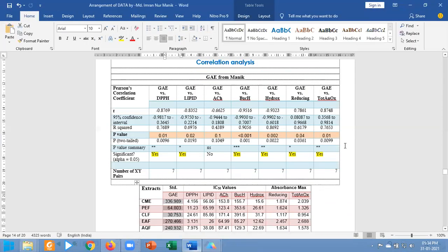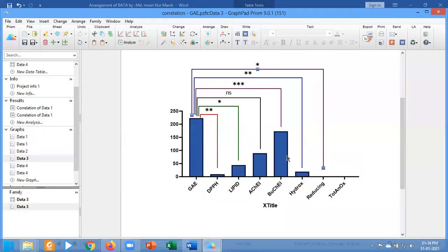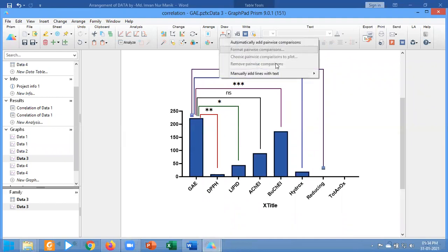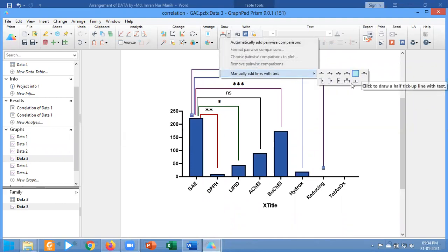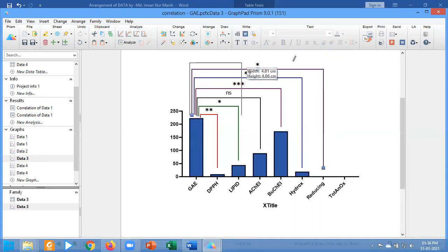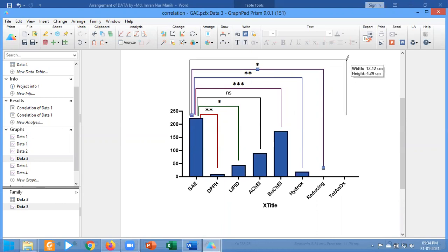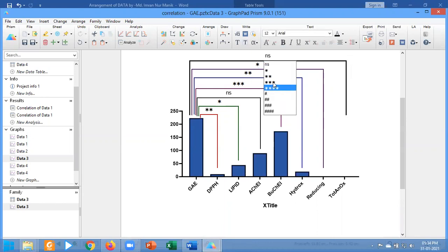And finally, the final one with total antioxidant with two asterisks. Going to change the color of this one, two asterisks.